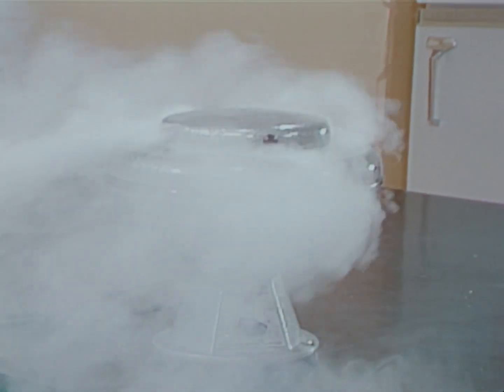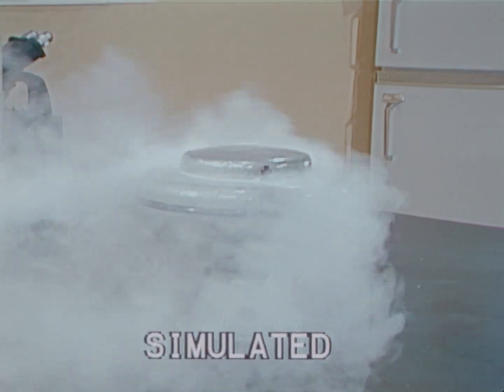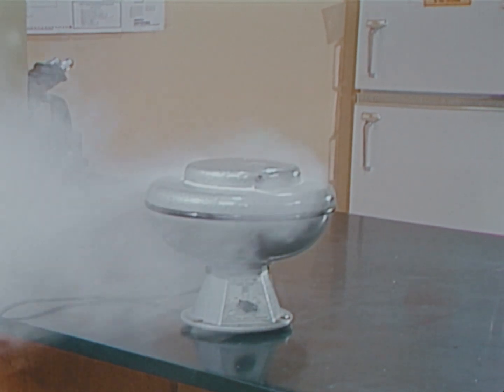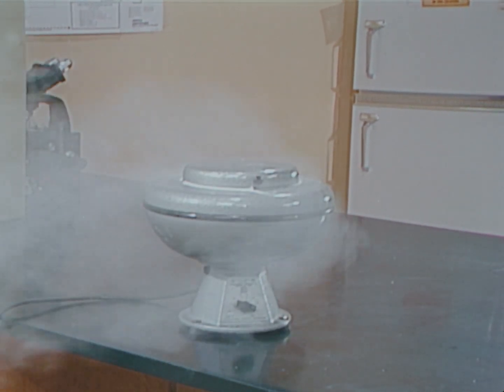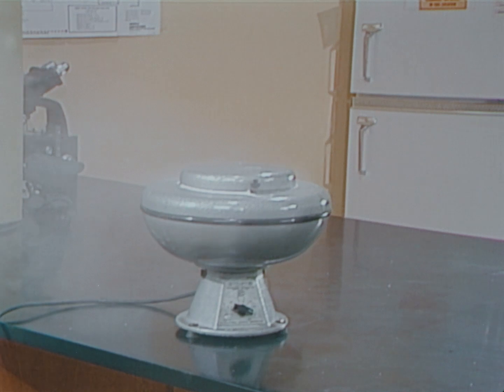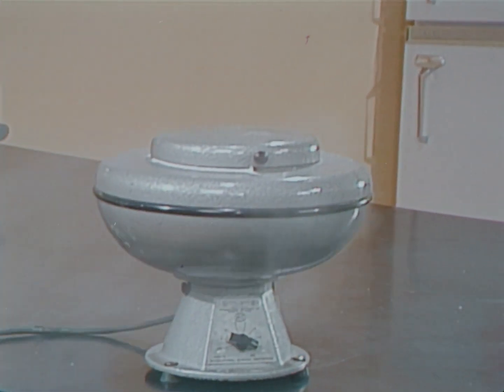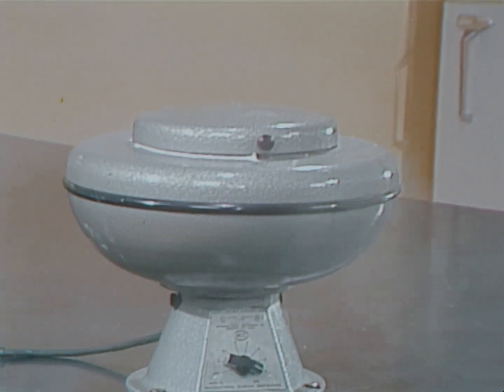Under certain conditions, aerosols may escape from a tube during high-speed rotation. The most dangerous situation occurs when a tube shatters in the centrifuge shield. Released microorganisms have been detected up to 12 or more feet from the centrifuge.